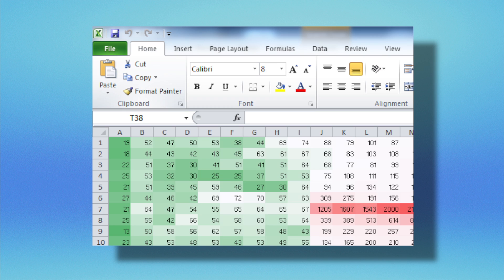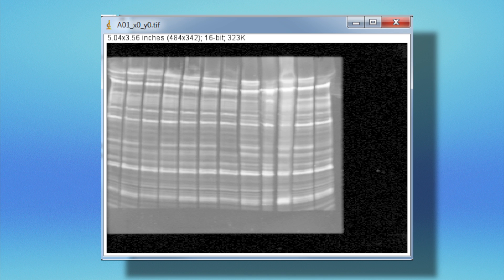After image acquisition, send your data to Excel or use the ImageJ add-on for further quantitation options.